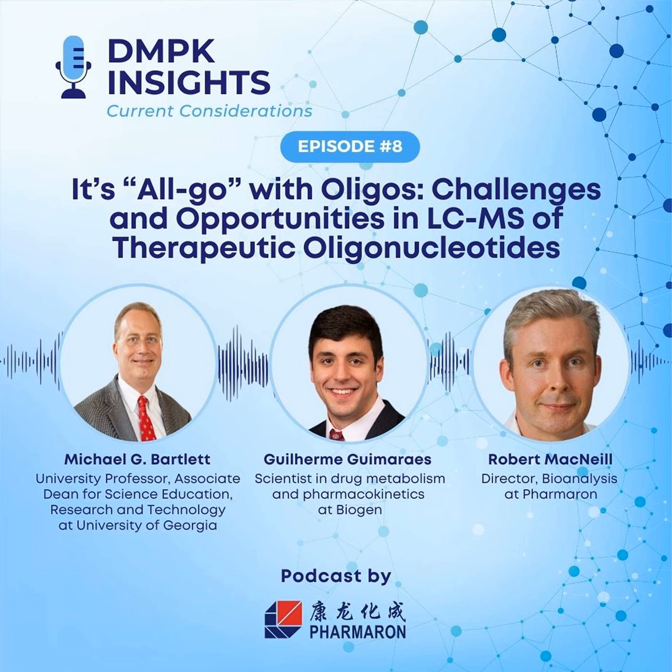That's right. I've heard it said that HILIC, if you were to scale it down to micro or nanoflow, doesn't have much chance of working. And I know you guys have done a bit of work in that particular domain. How might we increase sensitivity through scaling down in the manner suggested to micro or nanoflow LC? Can this be done with ion pairing reverse phase and HILIC and maintain practicality, ruggedness of performance, and reliability, do you think? I think that's a fair question.